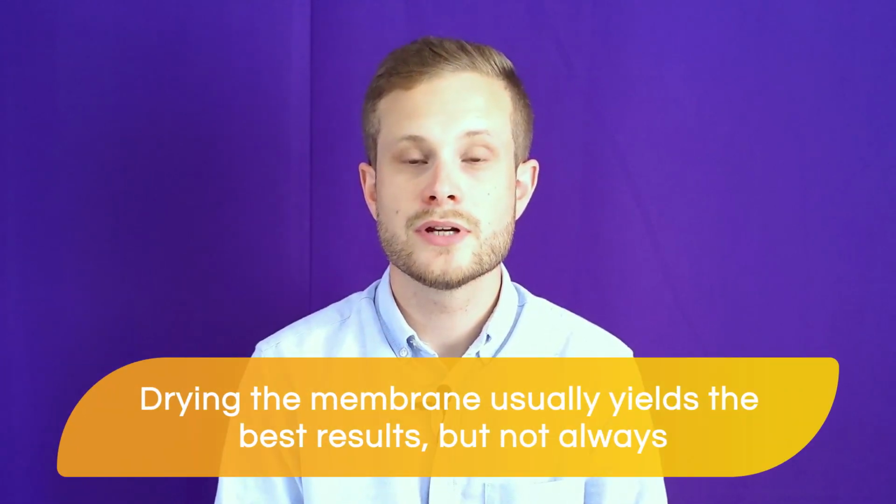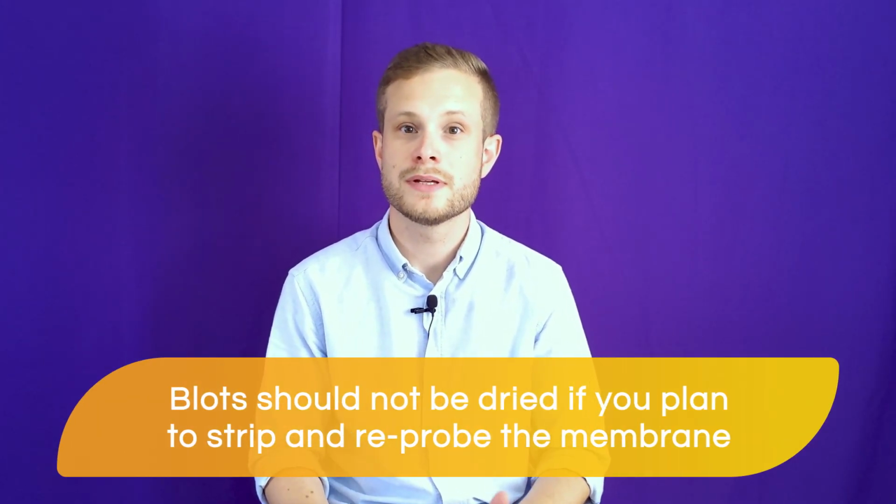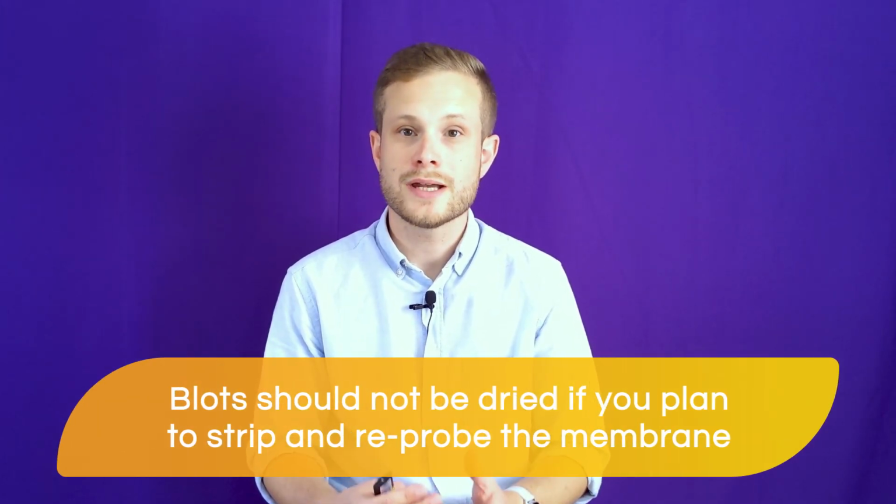LICOR's Western blot storage bags are the ideal solution for storing your blots. You should test both wet and dry imaging to see which works best for your particular blots. Drying the membrane usually yields the best results, but not always. If you happen to have quite a high background on your blots, then drying can actually sometimes reduce the signal-to-noise ratio, so make sure to try it both ways. However, blots should not be dried if you plan on stripping and reprobing the membrane. Drying the blot greatly increases the strength of the bonds between the antibodies, the proteins, and the membrane, making stripping the antibodies much harder.